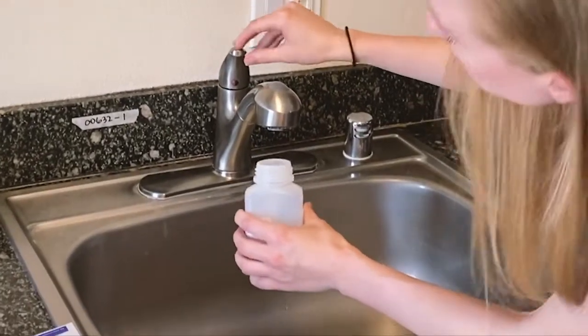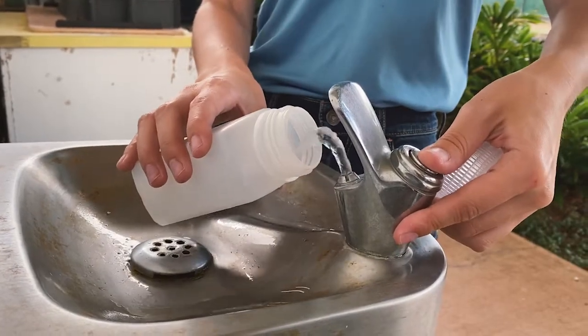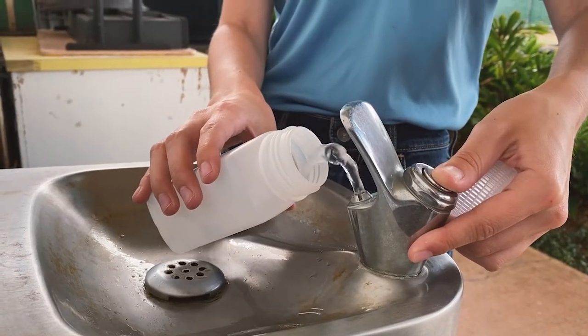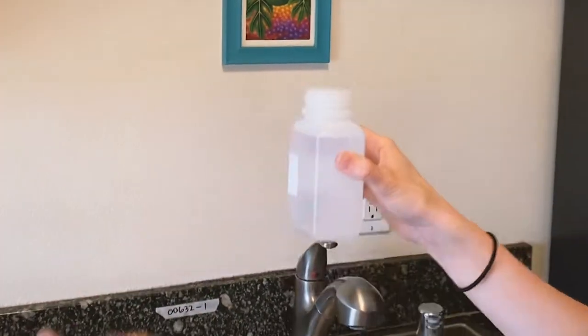Line up the sample bottle under the faucet or fixture and be ready to collect the very first stream of water that exits the tap. For sampling drinking fountains, angle the bottle to try to catch the first stream of water. Turn on the cold water and fill the bottle up almost to the top, leaving a little room at the neckline. Be careful not to overflow the bottle, but if you do, do not dump out any water.